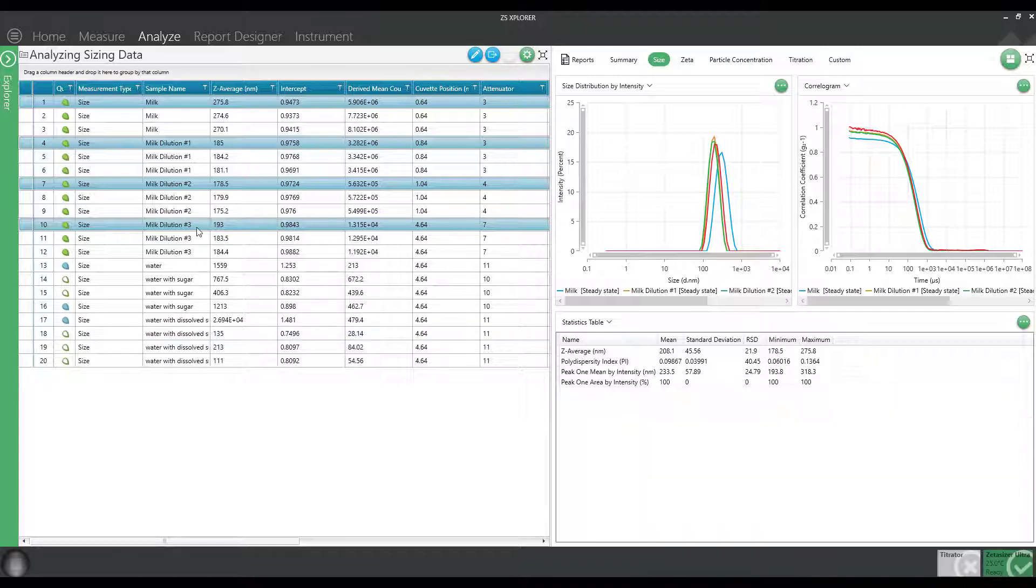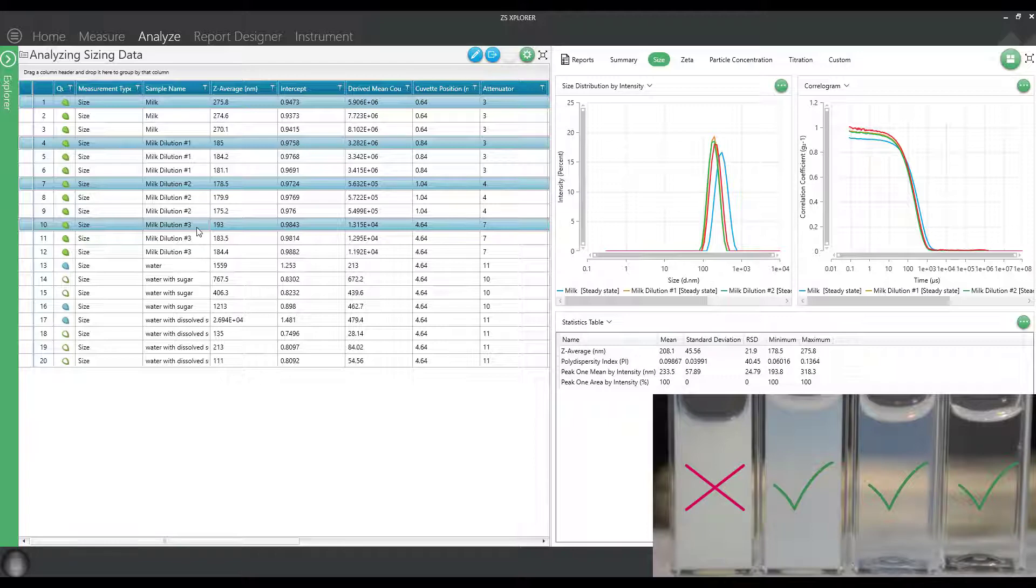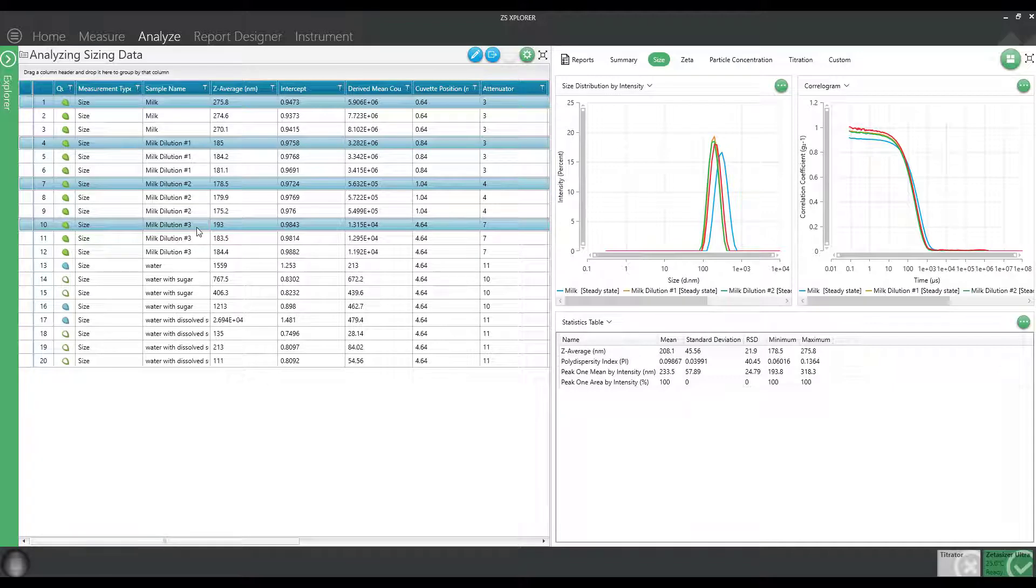So I get this question a lot of what attenuator value or what cuvette position should I measure in to get the best results? And really, it just depends. As you can see, I could use dilution one, two, or three, and those are very, very different concentration ranges. Either one of those concentrations will give me good sizing data. What you want to do is find that concentration range, which will be very broad, that will work well for your sample and stick with that. And avoid the edges of too concentrated or too dilute.